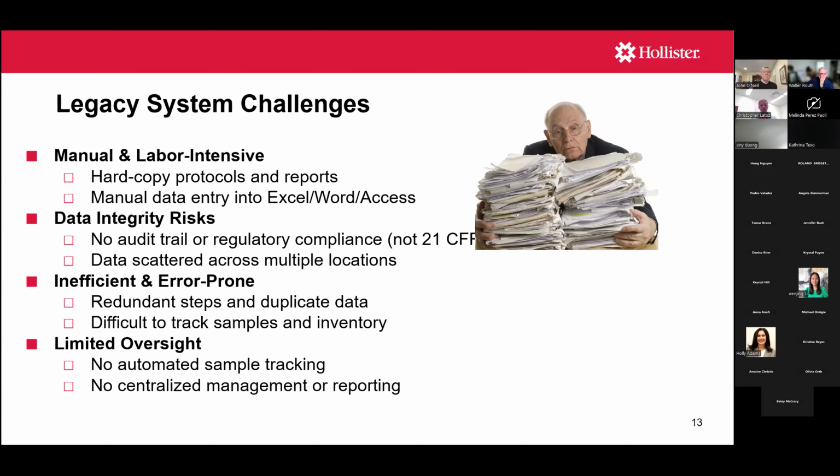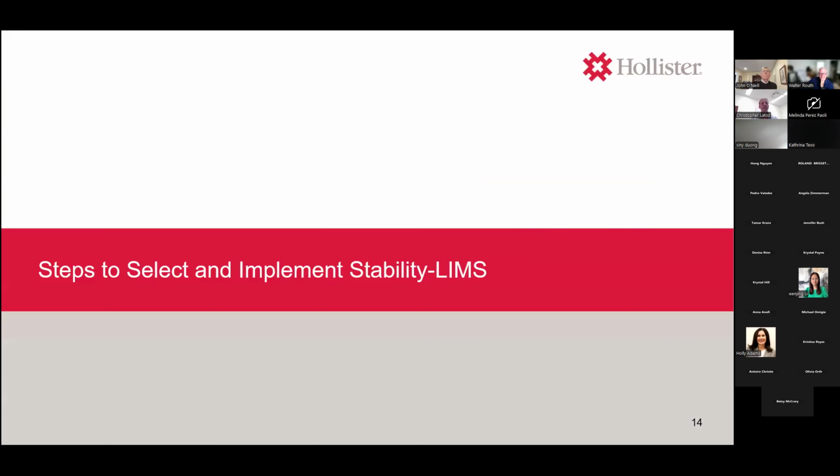Reporting was another problem. Again, we used our Microsoft Word documents for reports, but there was other kind of reports that would have been nice to have. So now we'll jump into the 12 steps that we took to select and implement a stability LIMS.